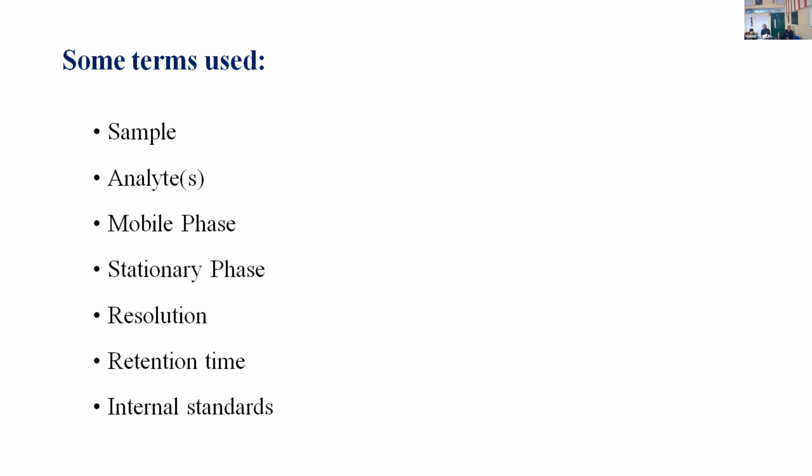Internal standard. Internal standards are structural analogs of the compound of interest. It is added in a constant amount in each sample, and it is added to ensure the consistency of the method, that is, consistency in the performance of the method.